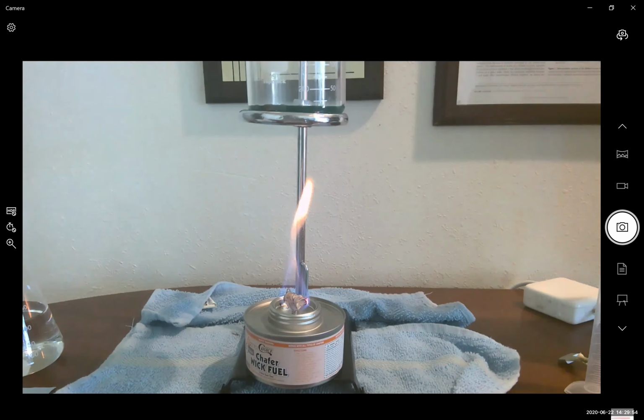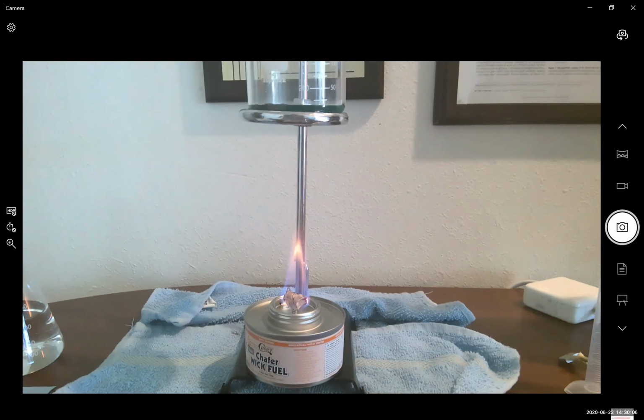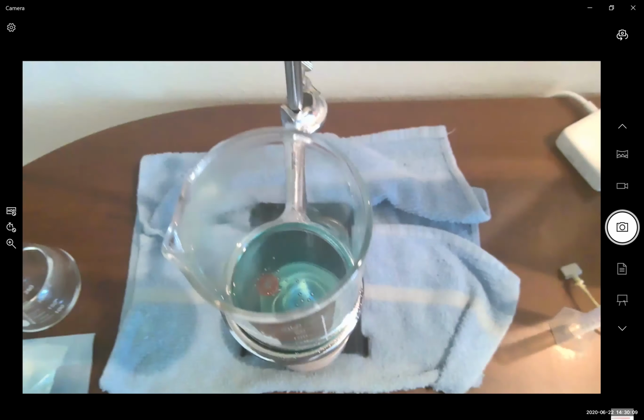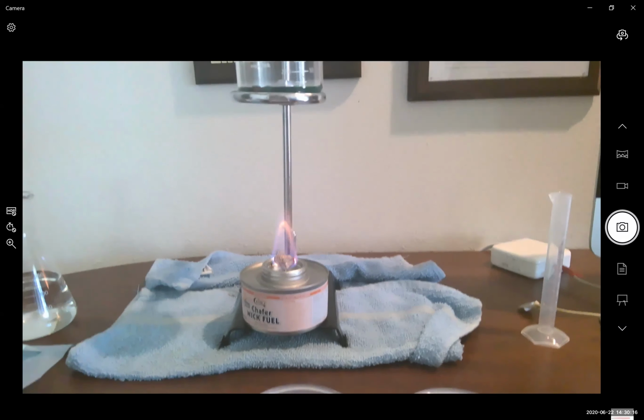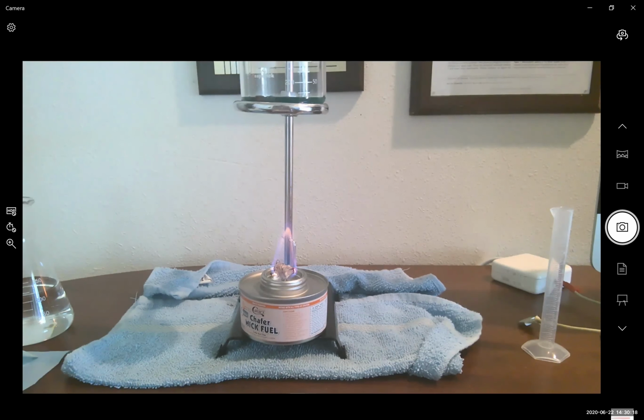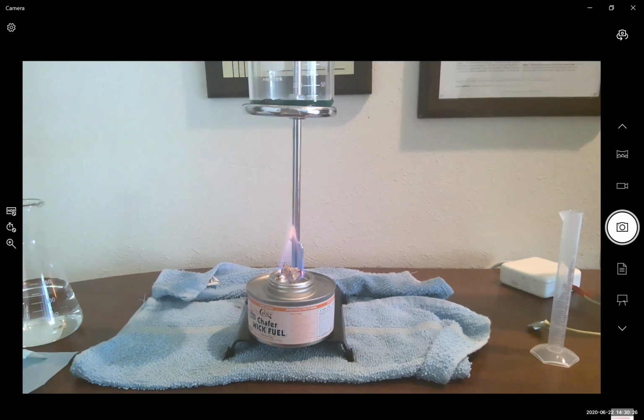In most chem labs, you have to wait for chemical reactions to take their course. It's good practice for when we move back to in-person labs. But overall, this is going quite well. We have our nice deposits of copper. Everything is occurring safely with no major issues. And we have about 7 more minutes until we're done heating and until we can snuff out the flame.